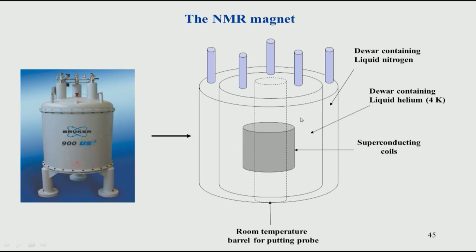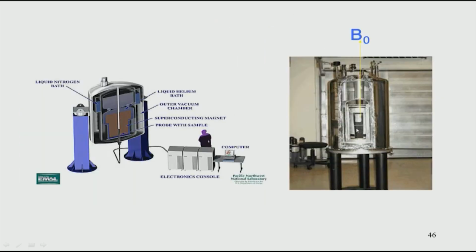So, this is how it is done. There is liquid helium surrounding this coil. We will see those pictures in the next slide. You can see this is a cutout of a magnet. This is an old system cut out from a non-functioning machine. You can see the interior of this, it is like an anatomy of a magnet.